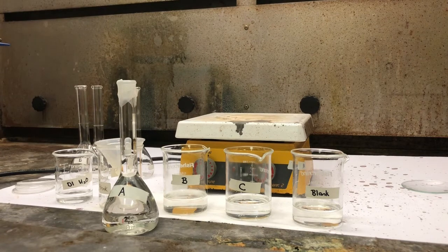And then we're ready to do our sample analysis. So we're going to do the same thing with the remaining samples and the blank as well. We treat them all identically, and then we can run them along with our standards on the atomic absorption unit.